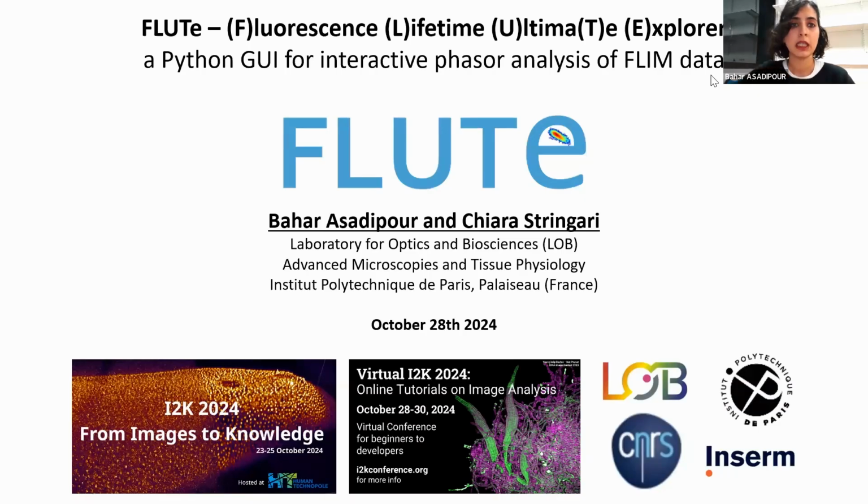The workshop is going to be on phasor analysis for FLIM data using FLUTE, which is Fluorescence Lifetime Ultimate Explorer. It's an acronym that stands for that. And it's a Python graphical user interface for interactive phasor analysis of FLIM data.